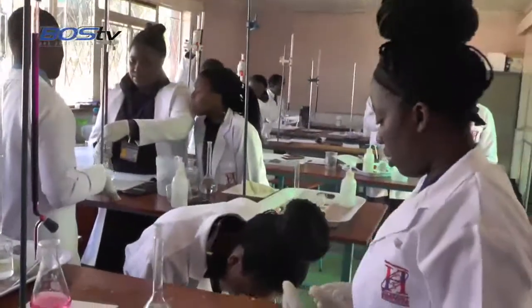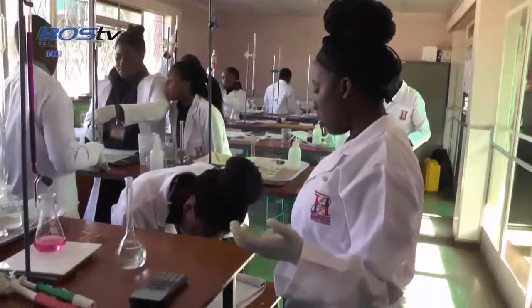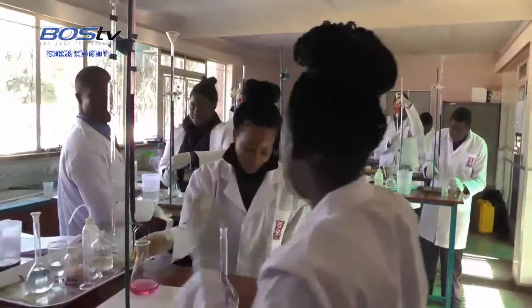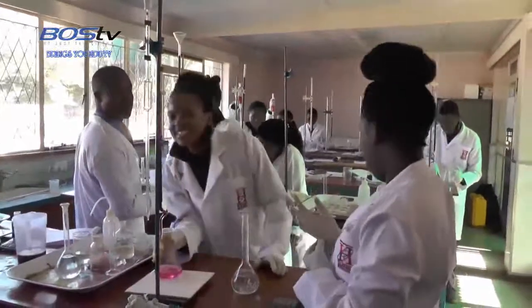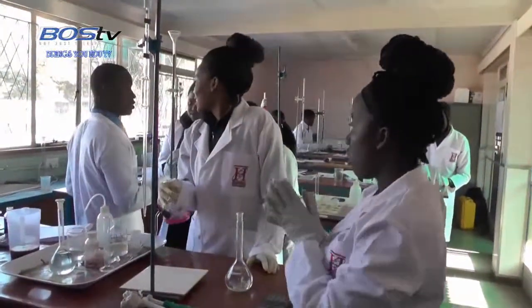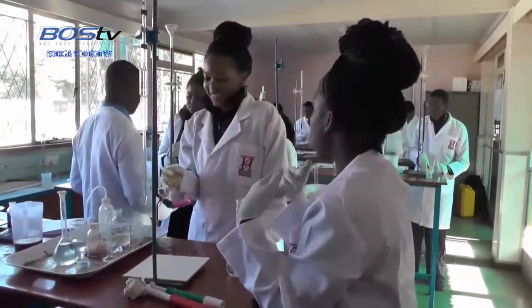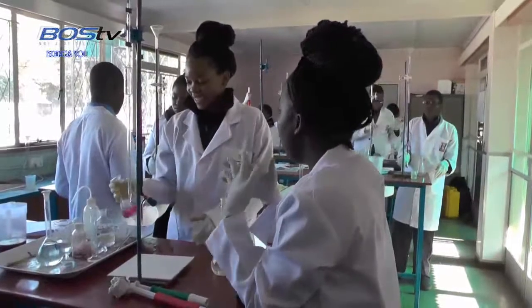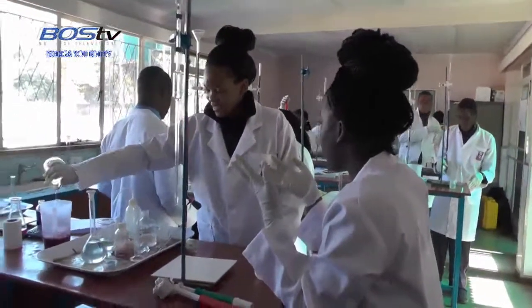25, 24. What was your rough titre? It was 36. Even my rough titre was 24. But I told you, see that I made it. My rough titre was 24.